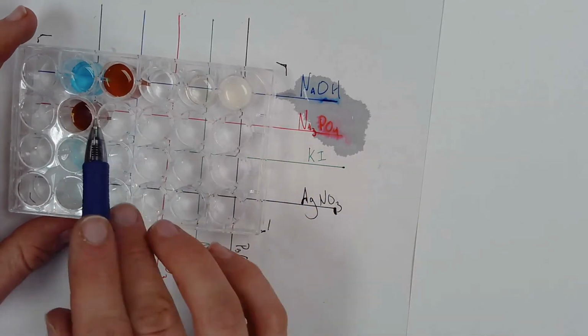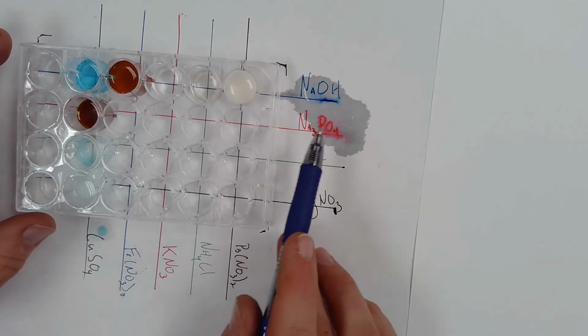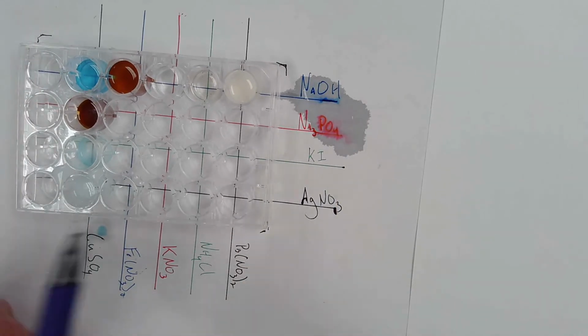All right, so now let's do this phosphate row. And I don't want to hit this home too much, but I'm only going to look at the phosphate ion. Why?